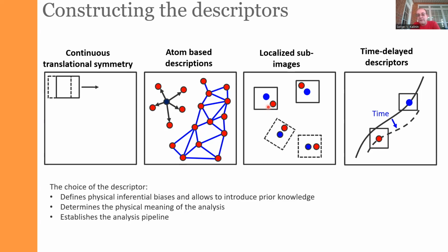It turns out that the biggest limitation for linear analysis methods is having the same structural units with different rotations in the image plane. In this case, we cannot use linear methods. We have to use rotationally invariant autoencoders, and that's something we are going to go through in 10 lectures from now. But for the time being, let's start with just patches centered on an atom.